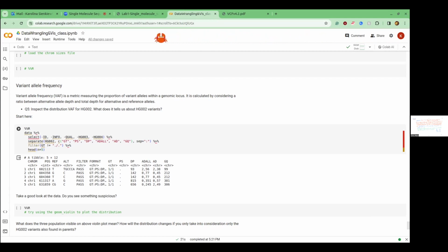Yes, and I have this written down in the full version that you will get, so don't worry, but that's a very important point. Yeah, no, I was just going to ask, is the number of alleles that are the reference allele the first one, the total? The first one would be reference, and the other would be alternative.